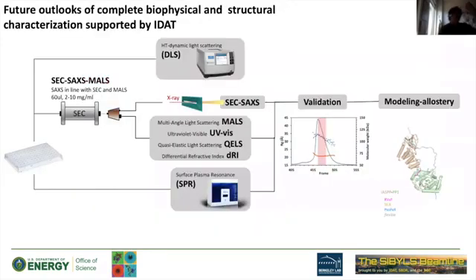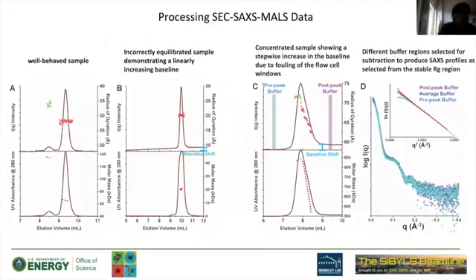We'll skip this one. We have mentioned a couple of times SEC-SAXS, obviously a very powerful tool for the users. They may come on site and spend some time with us and collaborate with the SPR for affinity. For this one, it will probably be important to see what the affinity between ASP and BP1 is, indeed, with the DNA protein complexes as well. Some journal information comes when you're receiving our merged data and your package about data quality, etc.